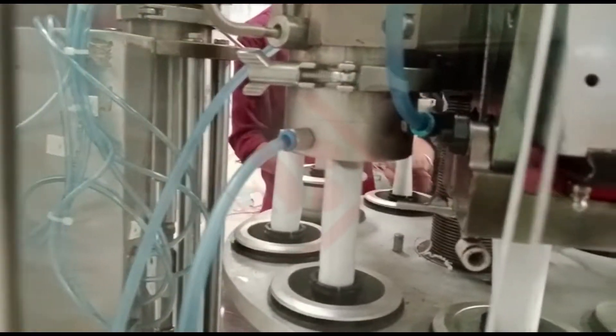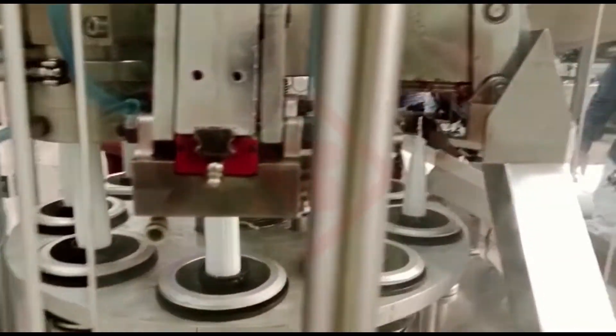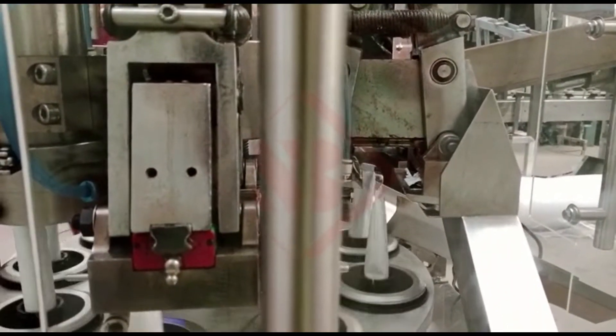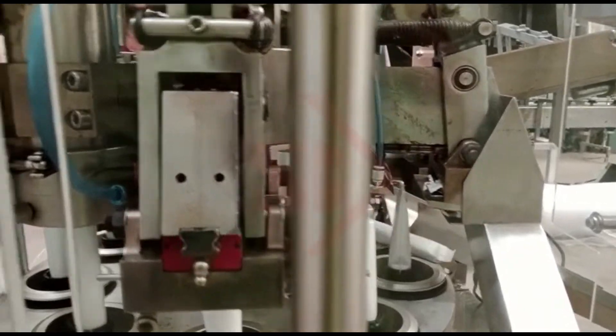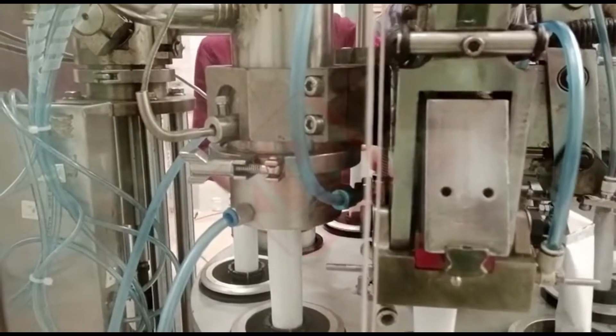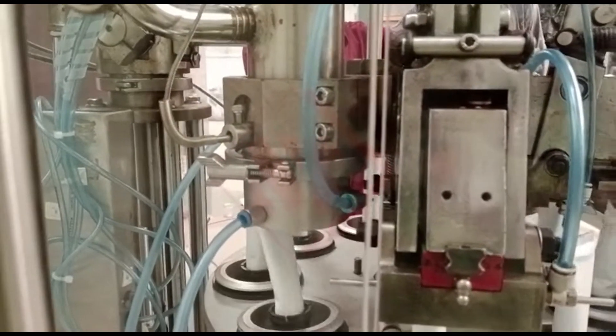Sealing Mechanism: Once the tubes are filled, the sealing mechanism comes into action. It ensures the proper closure of the tubes to maintain product integrity and prevent leakage. The sealing method can vary, including options like ultrasonic sealing, hot air sealing, or crimping.